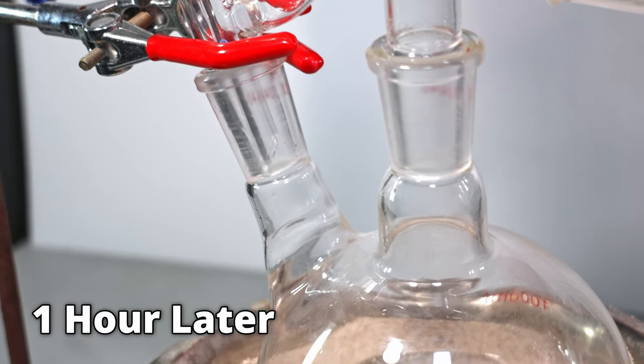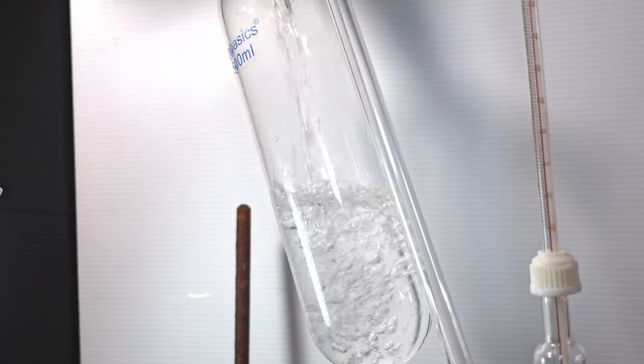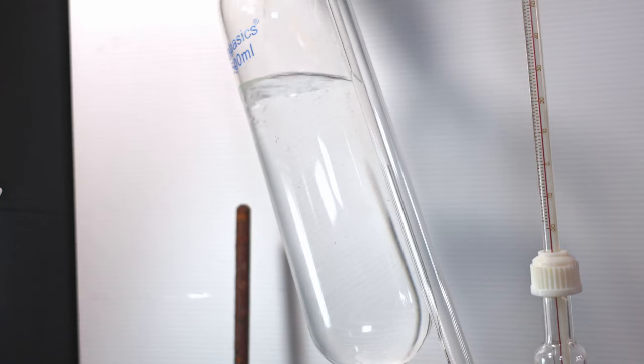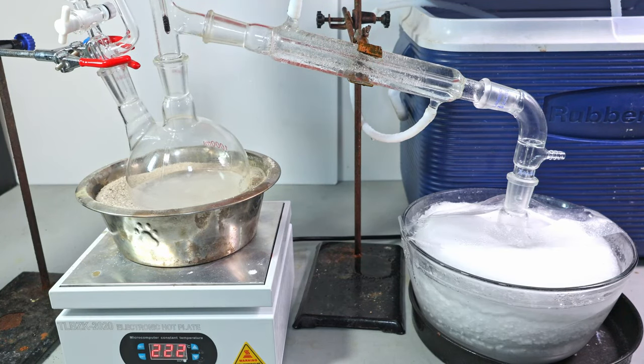Later, the tert-butanol has created a small layer over the thick acid so I'm going to heat it up. I'm also going to add another 300 milliliters of tert-butanol. With the acidic solution now hotter, let's see if we're making any isobutylene.